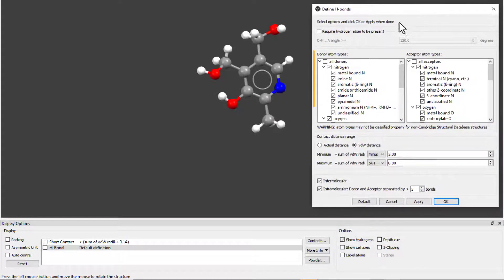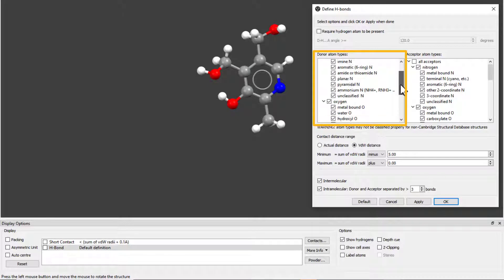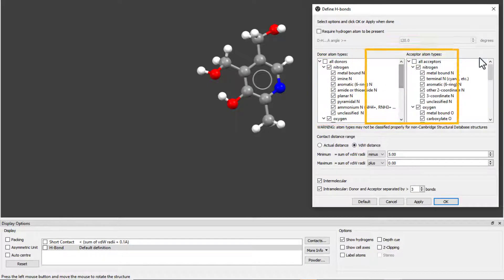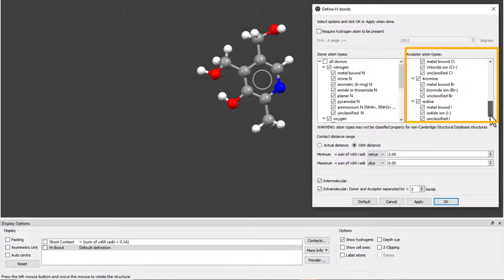We can see and select the donor atom types in the box on the left. The acceptor atom types in this box on the right.